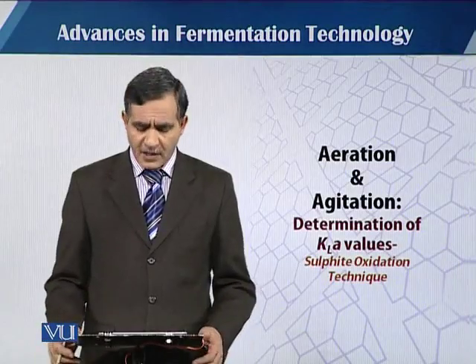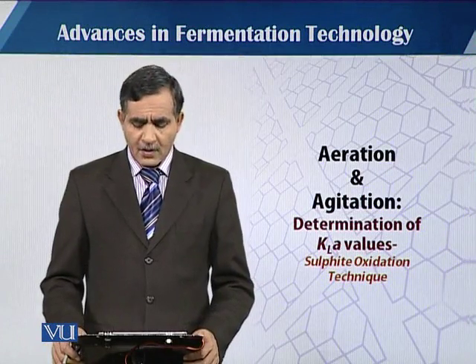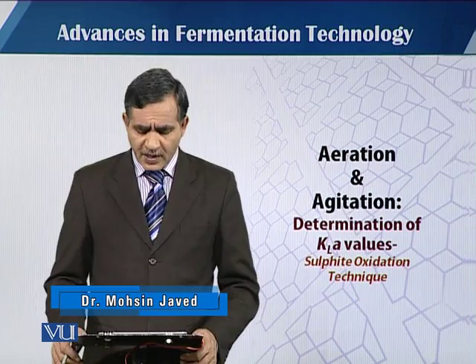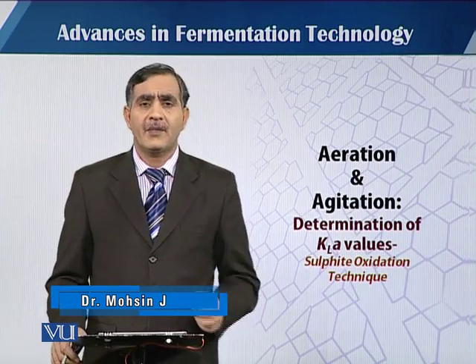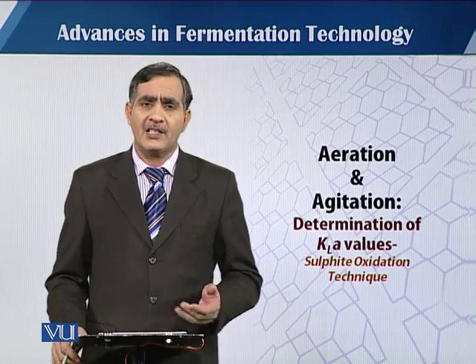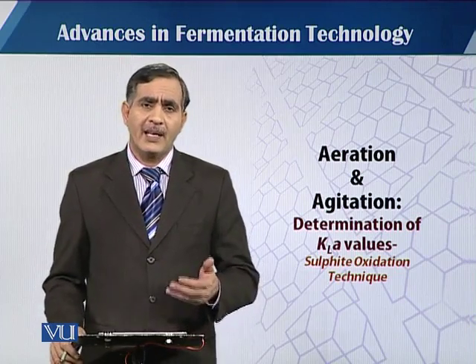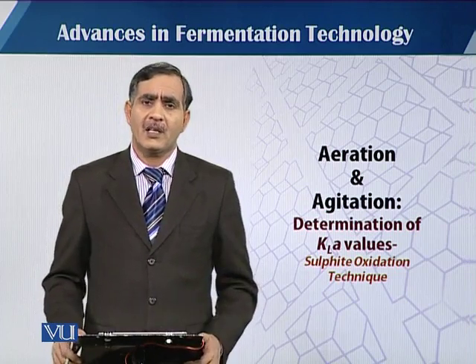In this module, we will talk about the determination of KLa with different techniques, but in this one, we will talk about the sulphite oxidation technique. As we know, KLa, the volumetric mass transfer coefficient, is very important in aeration and agitation in a fermentation process. If we know the KLa, then we can drive our fermentation process in a good manner.